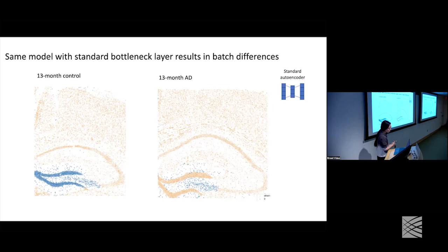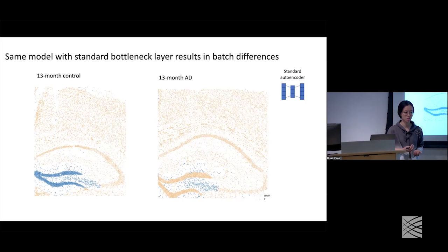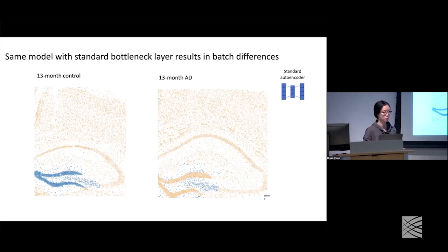So it's especially important that we correct for batch effect in spatial transcriptomics data, because although we have many batch effect correction methods for single cell RNA-seq, they only deal with the difference due to gene expression. But we now not only have batch effects due to gene expression, we also have batch effects due to the difference in tissue morphology, either because of individual differences or because of experimental handling. So our method is saying that regardless of what the source of batch effect is, you can always just take the latent space and make it larger, and all the batch effects will be removed.